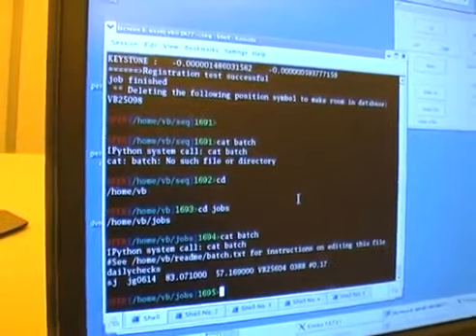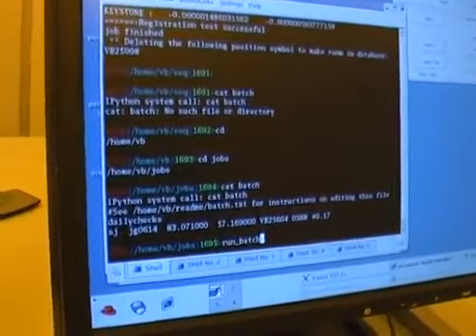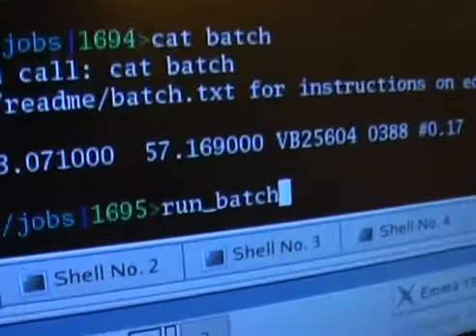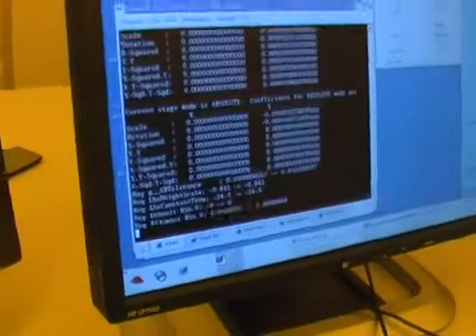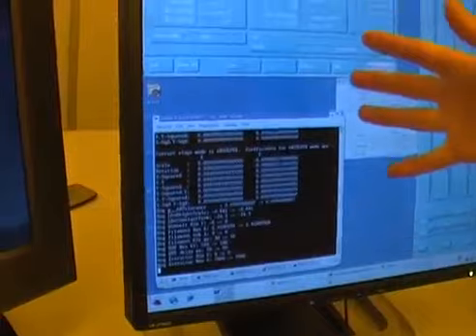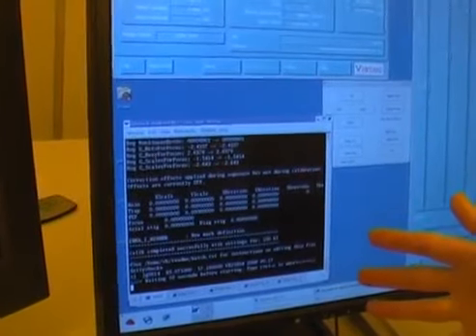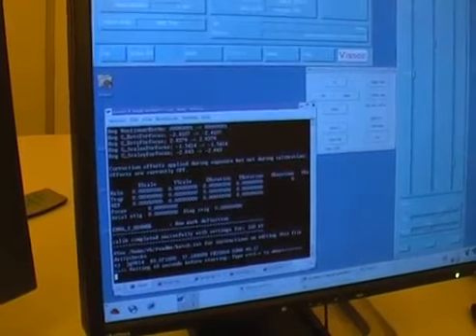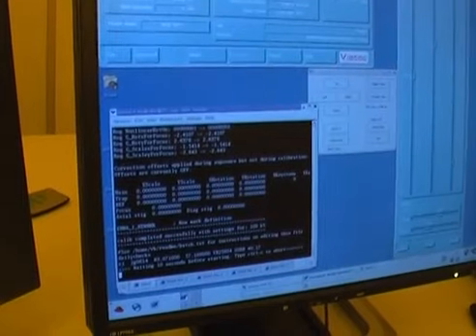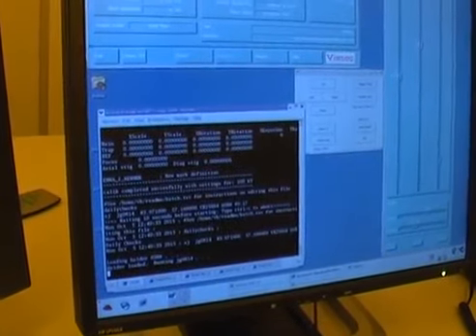So to run the jobs, we type run_batch, and this will set up all the jobs. Normally overnight there'll be a lot of jobs, but we're just running one at the moment. Set it going. Here we have some basic setups which we do for all jobs before we set it going. Now it lists it, and it gives us 10 seconds before starting. This is for the operator, that if they have any last minute panics, they can stop with Control-C before anything happens.